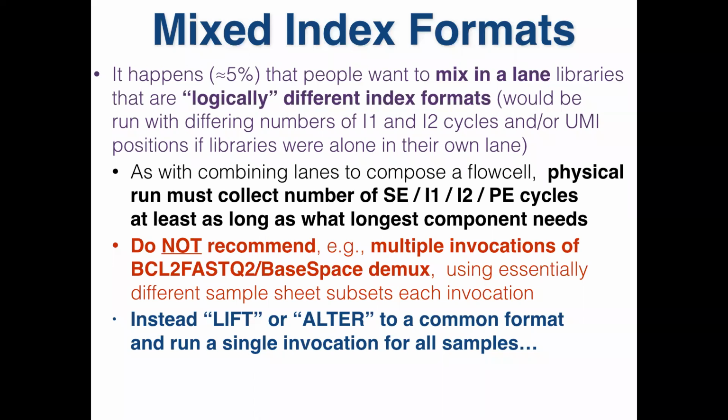Why? It's a single index library. Right? You're running it on a single index. No, not when it's mixed in the paradigm. Now, one thing people do at that point, which I don't recommend, I really don't.